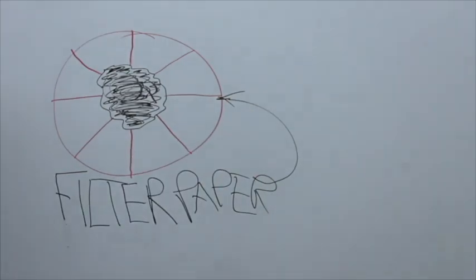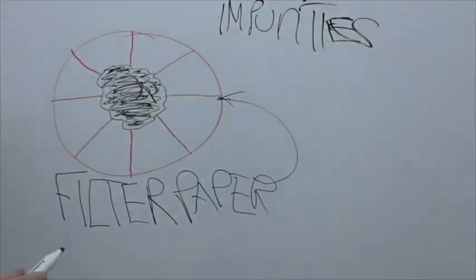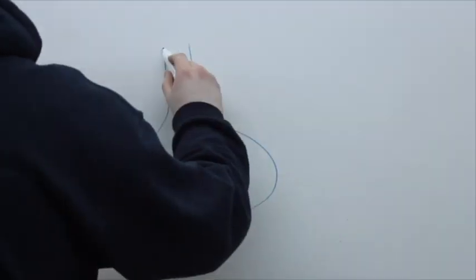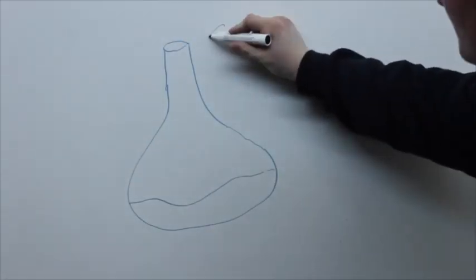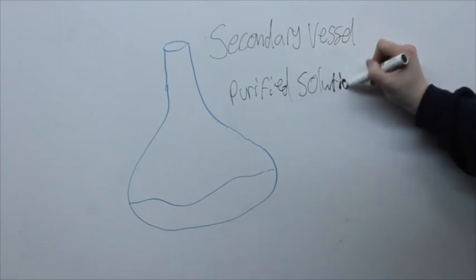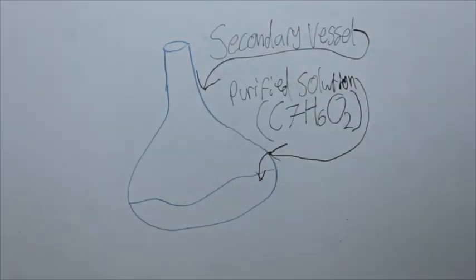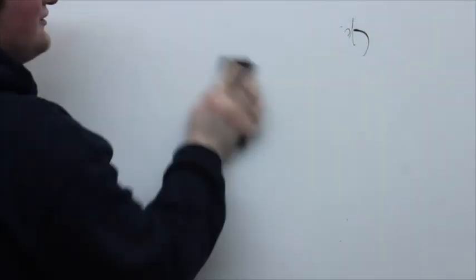This means that when the solution is filtered through gravity filtration depicted here, all that remains in the clean conical flask below the filtration funnel is a purified and transparent sample of the solution awaiting recrystallization in the next stage of this process.